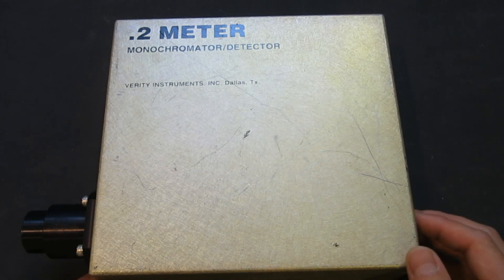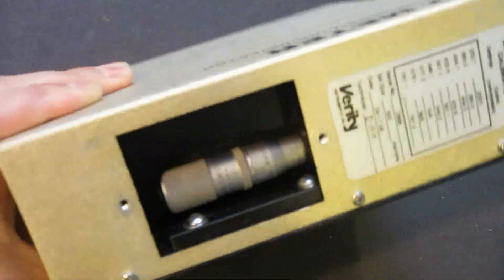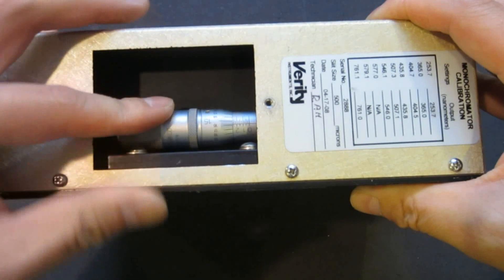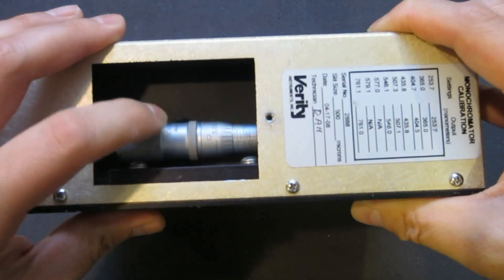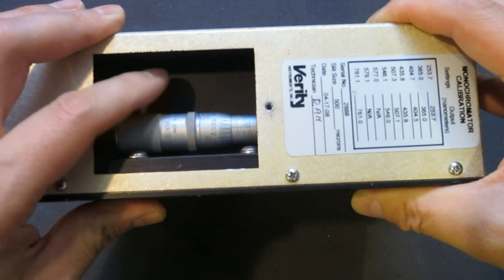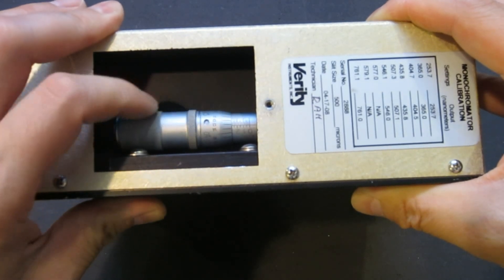Other than that, this is pretty standard. I took out the cover here and there's a screw micrometer gauge where you can adjust the wavelength. It's very smooth, so there's no reason for me to believe that anything is wrong with this meter.